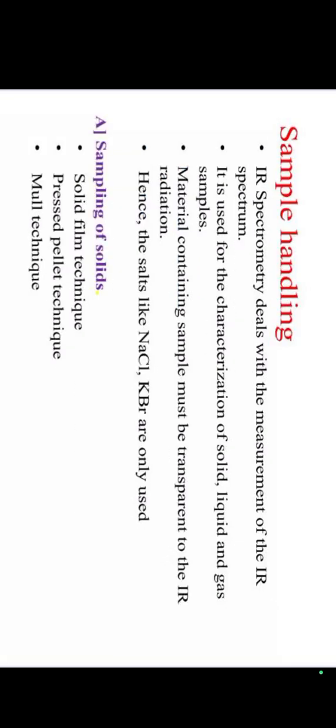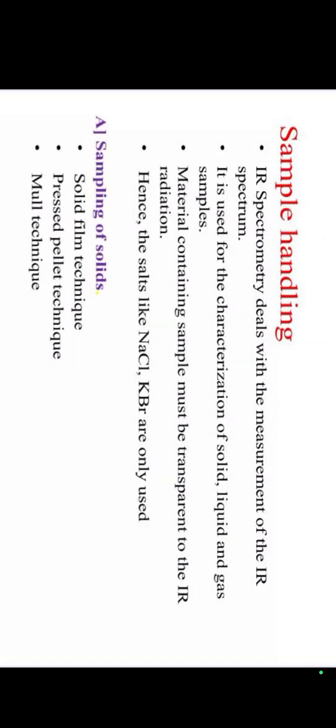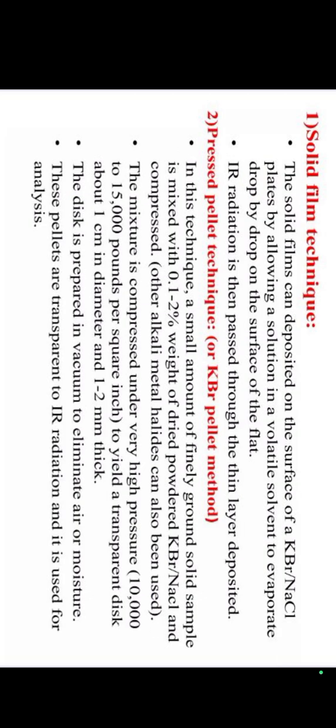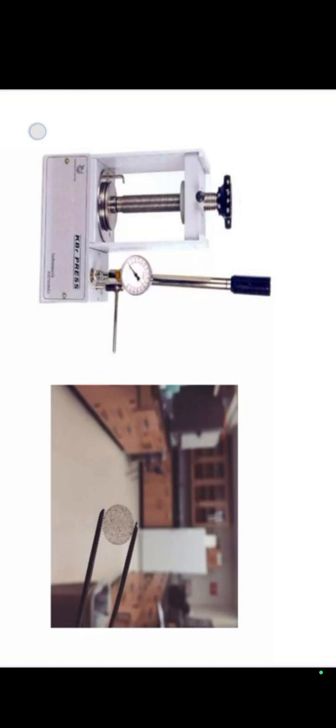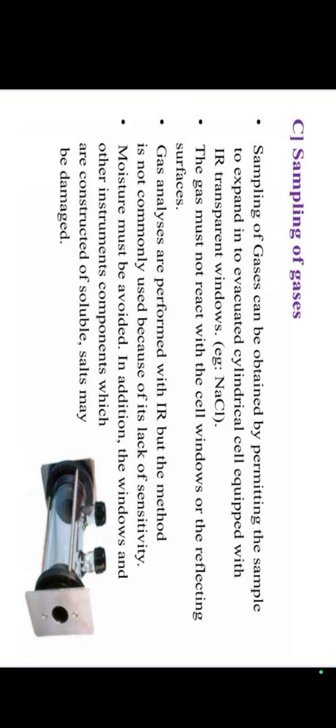Sample handling is divided into three: sampling of solids, sampling of liquids, sampling of gases. These we also see in this class. What are the techniques we use in solid sampling? That also we see: solid film technique, pressed pellet technique, mull technique. Sampling of liquids and sampling of gases we also discuss today.